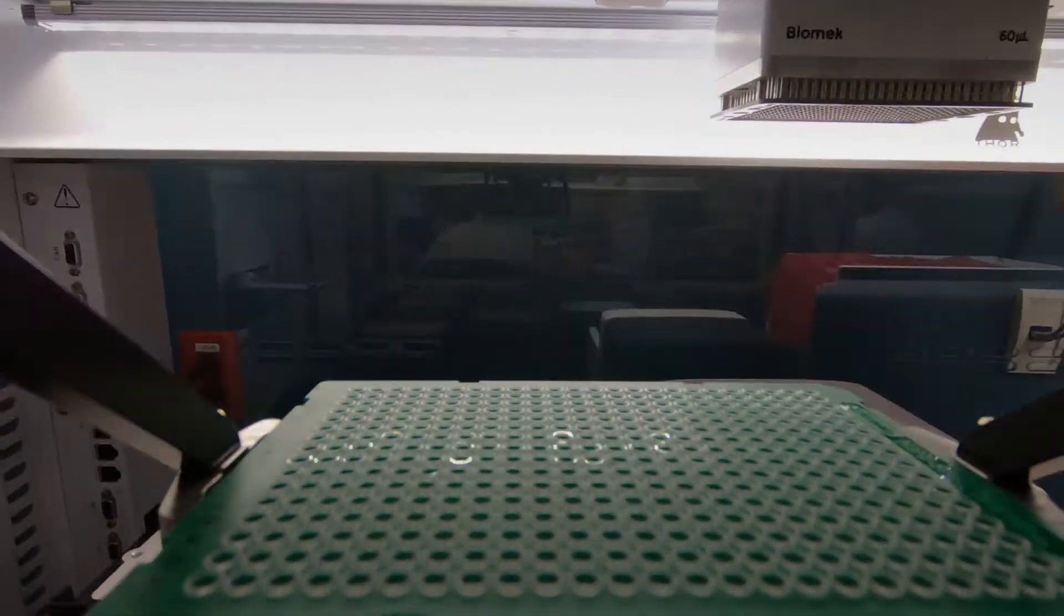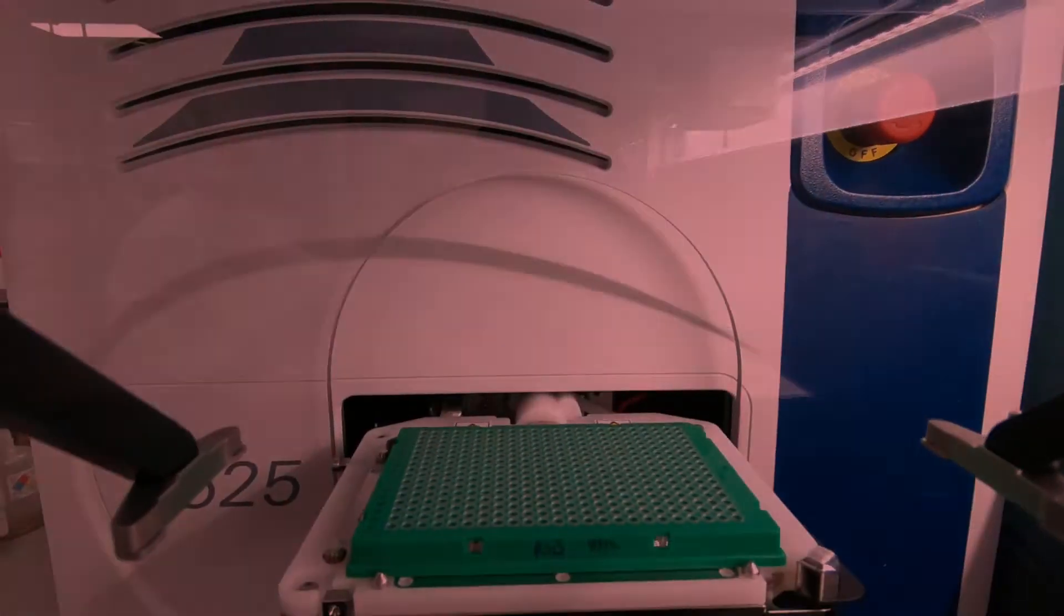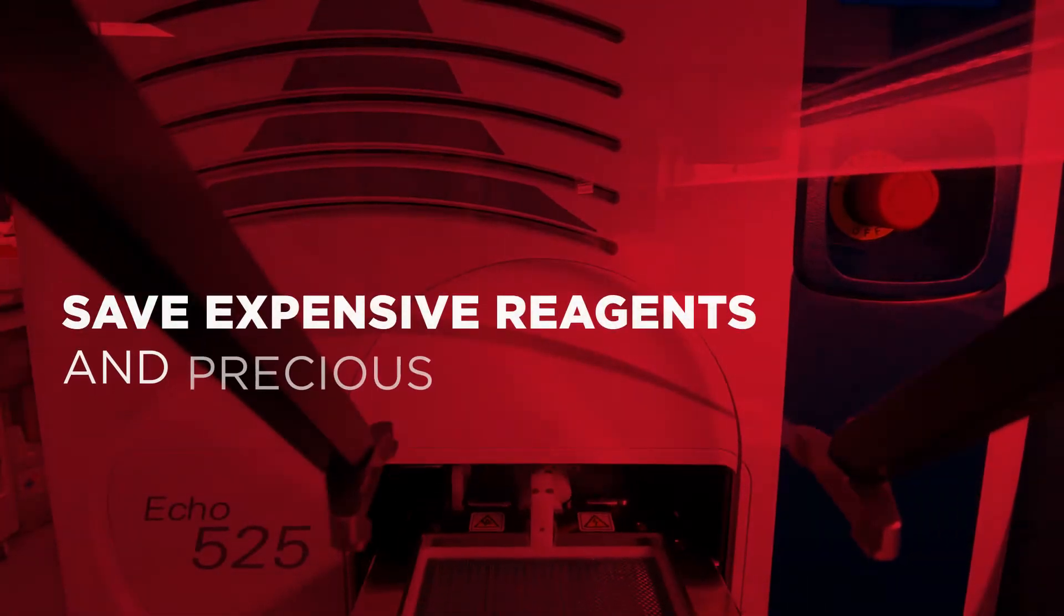Low-volume miniaturization and any well-to-any well dispensing of the Echo can save expensive reagents and precious samples.